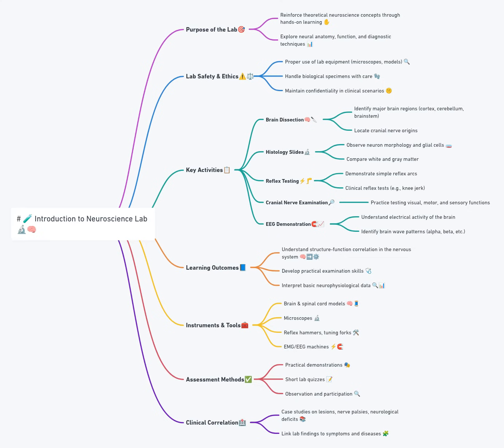Moving to the inferior aspect of the brain, identify the cranial nerve roots. Note that not all cranial nerves will be preserved in every specimen, but observe their general origin from the brainstem and their relative positions. Next, we move to a mid-sagittal section of the brain.